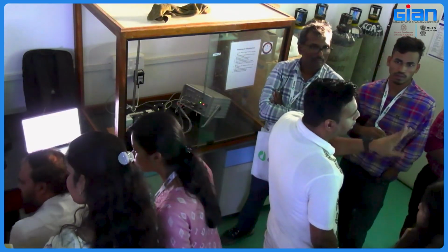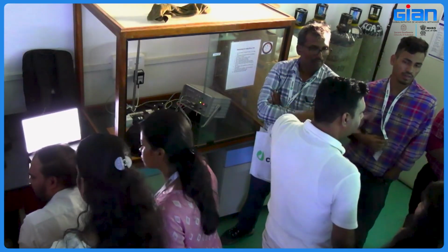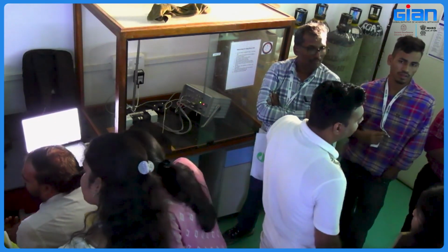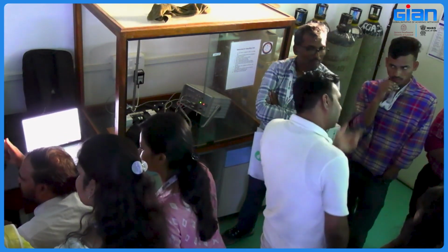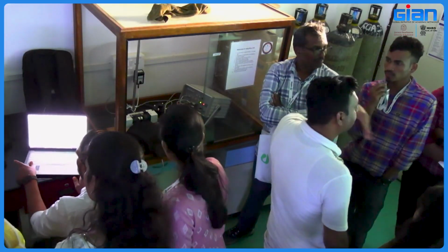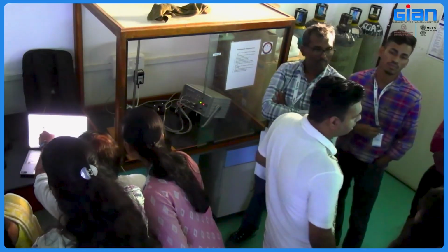I dark adapt all the plants at a time. For the light curve, I take that single plant, take a leaf of it, and take the readings. After the readings are over, I take the second pot, which has a single plant. That way I have very little margin of difference. Those will be technical replicates, but the margin of difference is very small.